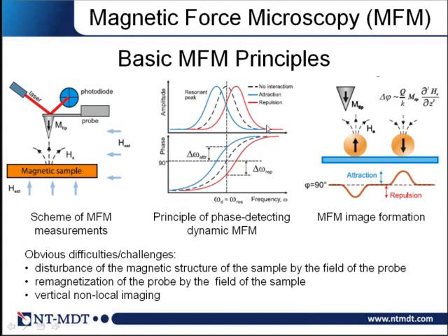There is also a question about the permanent magnets. How can one calibrate the magnetic field? Well, this field is rather inhomogeneous. As I said, these inhomogeneities are macroscopic. So if you look at the pictures, I have shown that the changes of the magnetic field happen on the scale of millimeters.